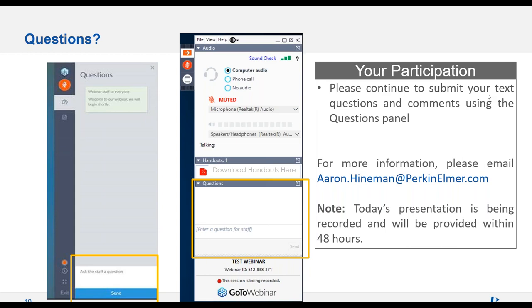And the low end really shows, like in lithium and beryllium. It's literally 5 to 10 times more sensitive. It's amazing. So to answer that question, if you do your tuning on it and you can see both masses, then yeah, you could probably do this work.